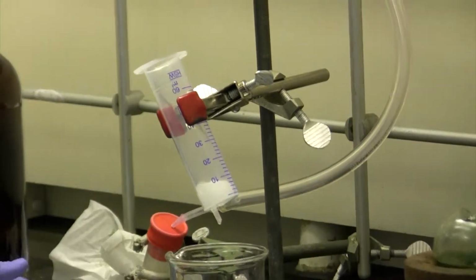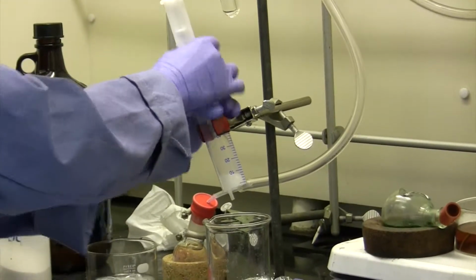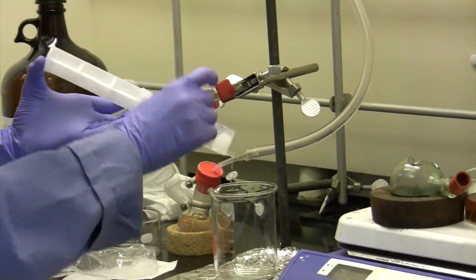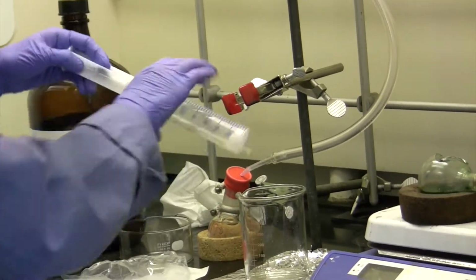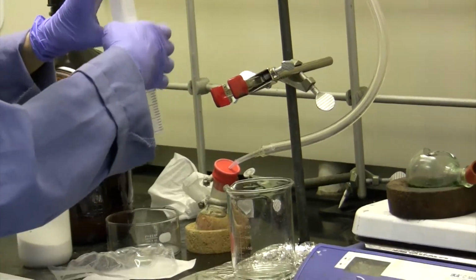Now I'm going to take the plunger back out and I will put it in to basically kind of mash down. We want to make sure the cotton's blocking the hole. Got a little violent there.